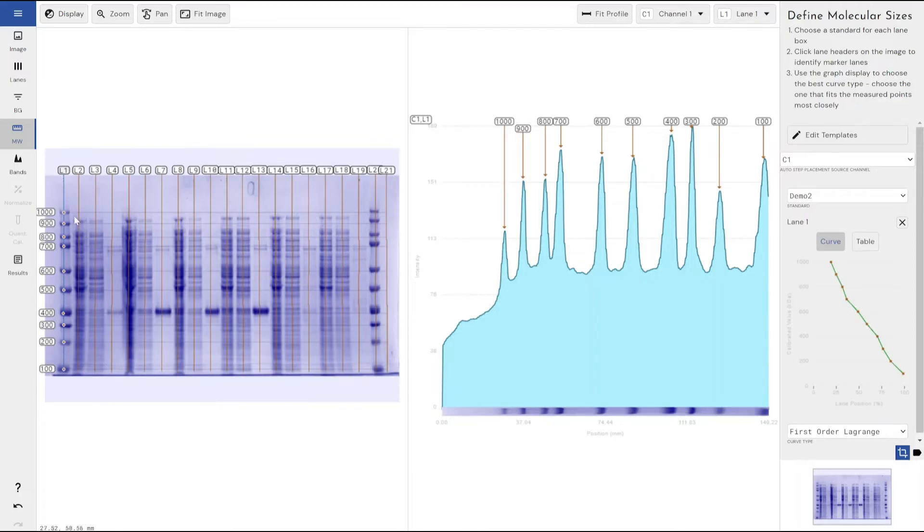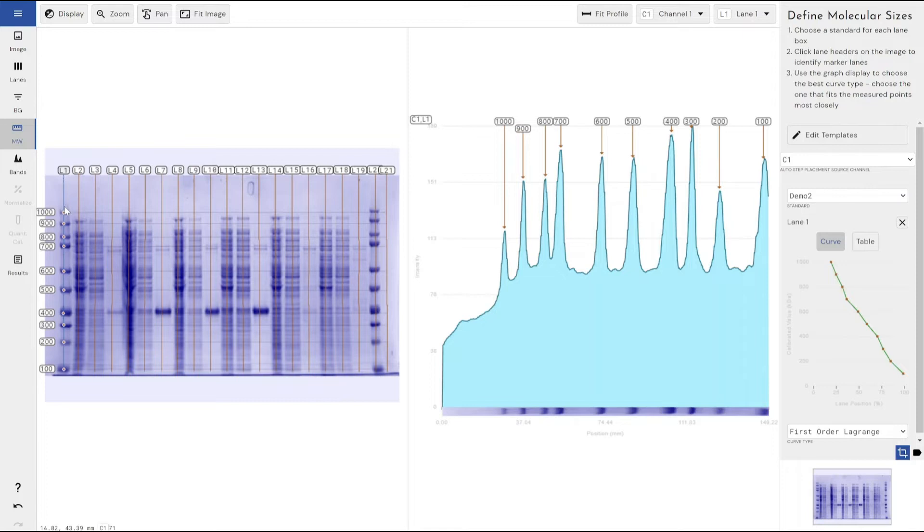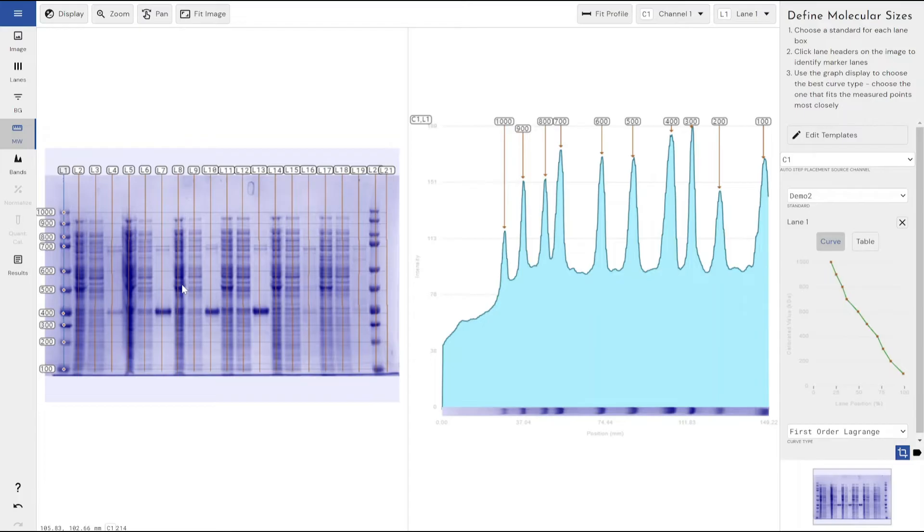Typically, you want the detection parameters for your molecular weight ladder to be very different to the detection parameters that you've used for your other bands of interest because they will be much fainter proportionally. The same settings that would identify your molecular weight bands very well are likely to not identify your unknown sample bands very well, and vice versa.